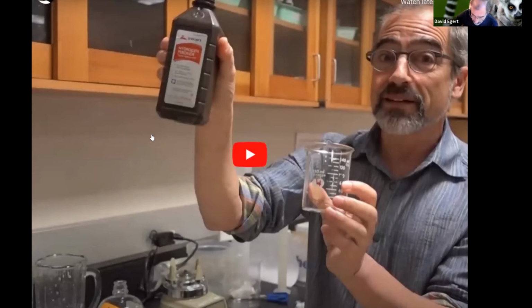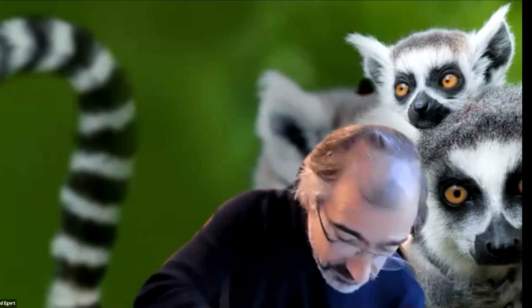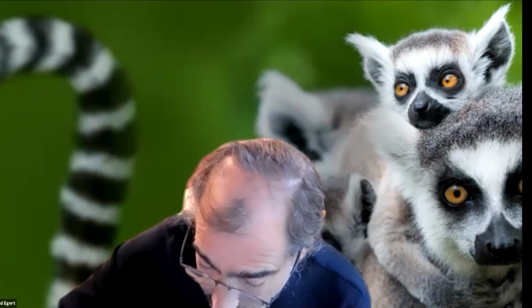Okay, all right, so that is the enzyme that we actually are going to use. We usually just mix it up fresh when we do the lab. And you can see it works. It really does make the hydrogen peroxide break down.